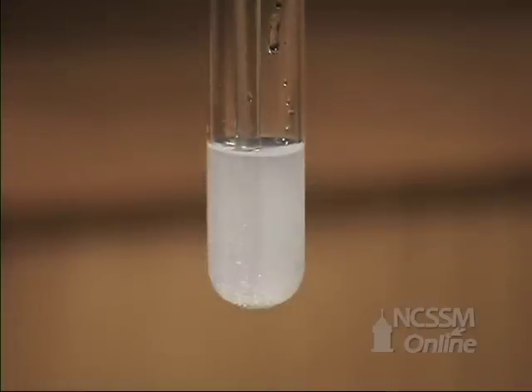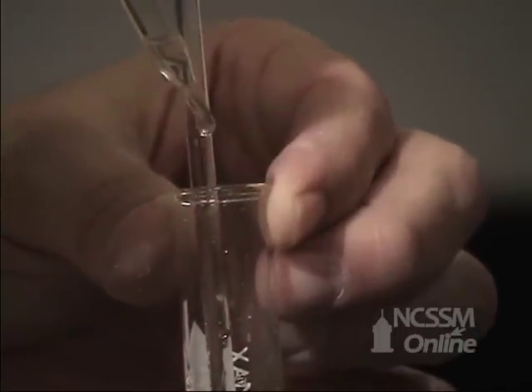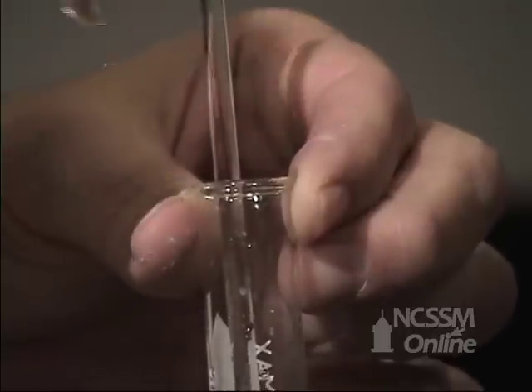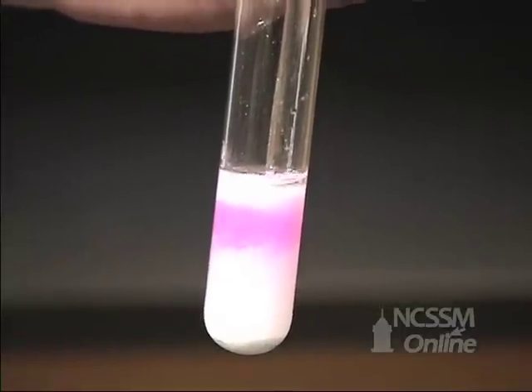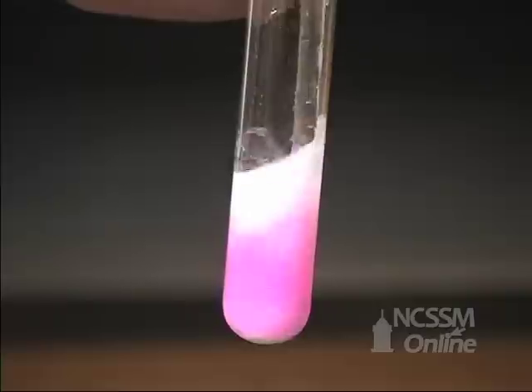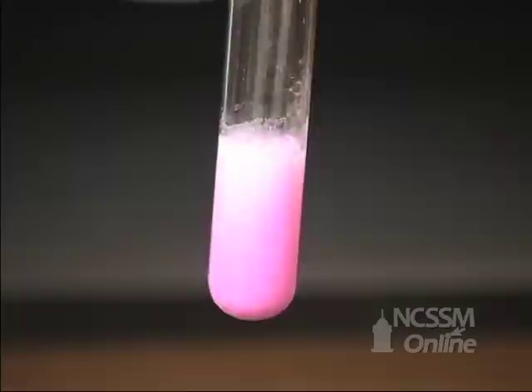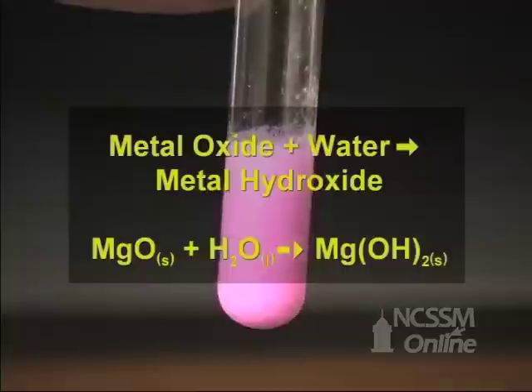One way to test for the fact that we're producing a metal hydroxide is to add phenolphthalein to the solution. Phenolphthalein is an acid-base indicator that is colorless in acidic solution but is pink to purple in basic solution. The formation of the purple color indicates that we've converted the metal oxide to some of the metal hydroxide.